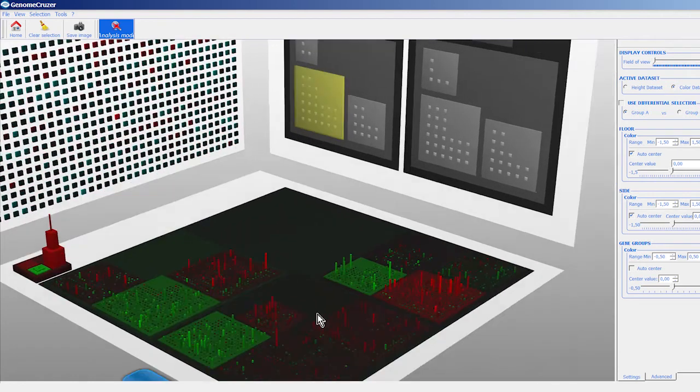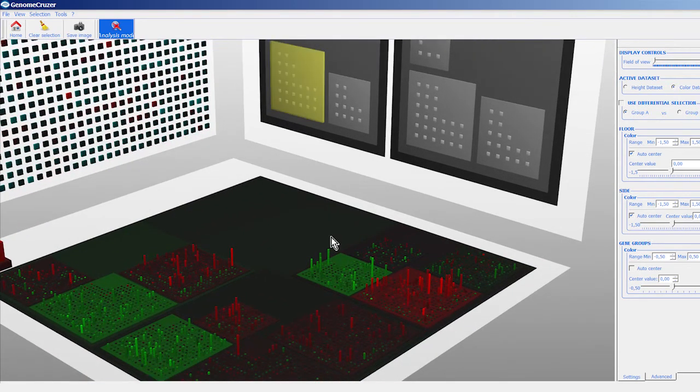So if we look at single genes, we can see that they are, as before, endowed with a color, which represents their expression value, in this case the average expression within the samples. But they also are endowed with a height, that in this case is a statistical measure that indicates how significant the differential expression of this gene is within this cluster of patients with respect to the general population.